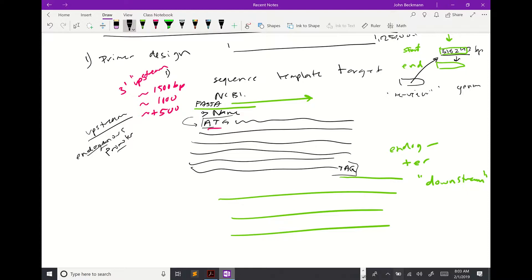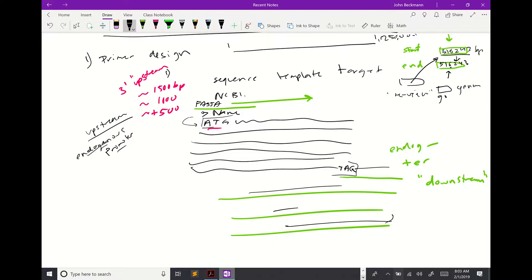If you edit those numbers and hit 'go,' it will change what you're being shown. So if you wanted the terminator, whatever this end number was, you would increase that to move forward beyond the end of the gene. That's how you would get those sequences.